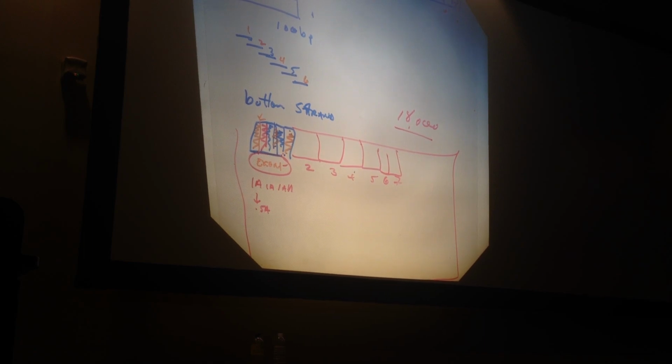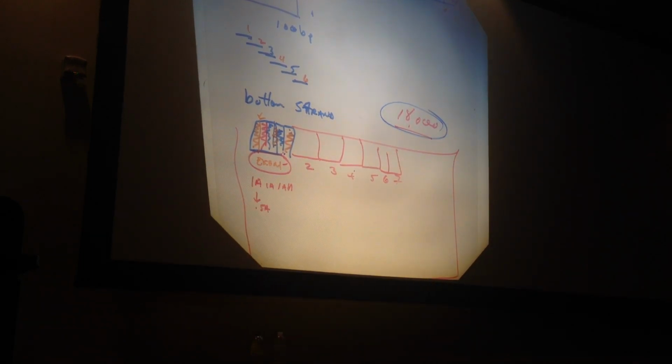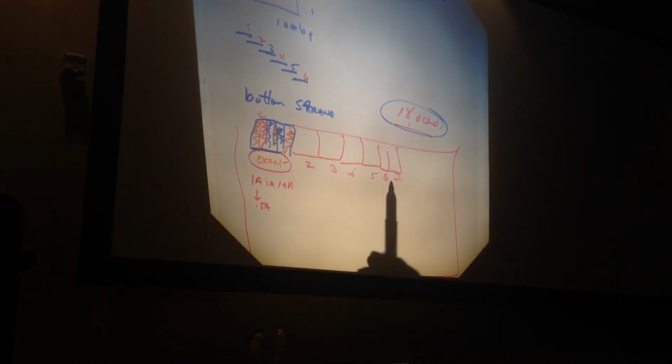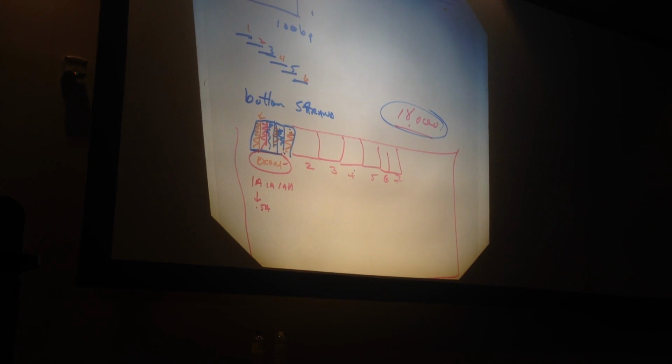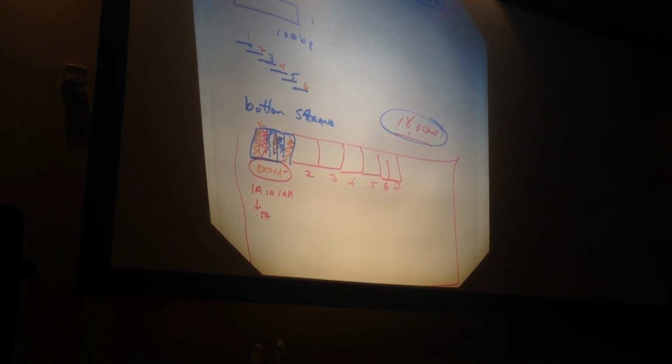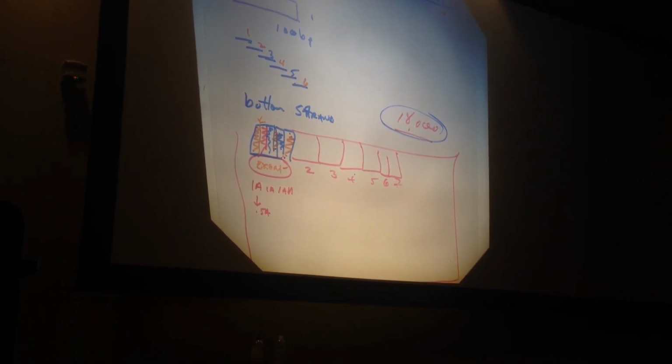Are we no longer doing thousands of genes at a time? Well, we had 18,000 places, and this is just 7. Okay, so each of those is on the chip, 1, 2, 3, 4, 5, 6, 7. Each of these represents one unit in their chip.